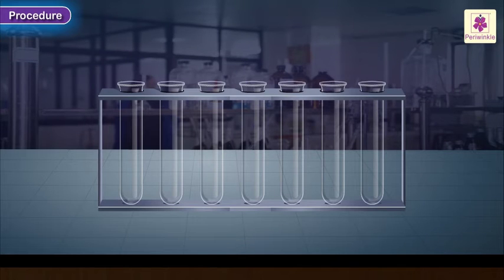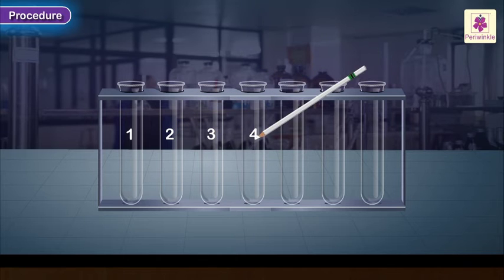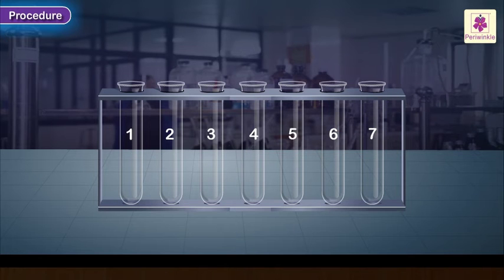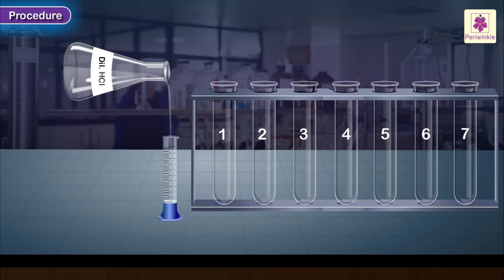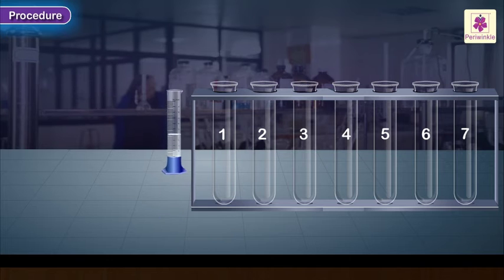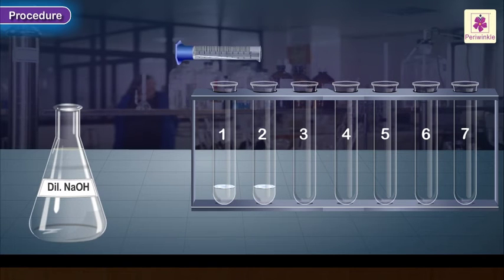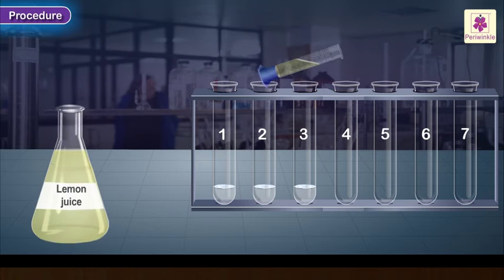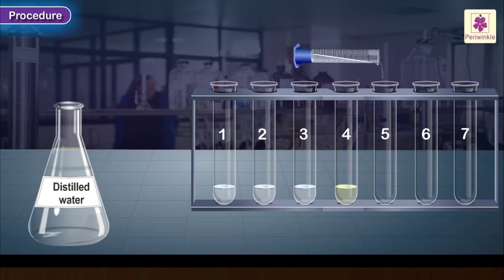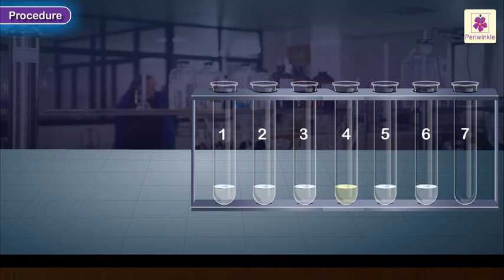Take seven clean test tubes, as there are seven samples to be tested, and using a glass marking pencil, number the test tubes one to seven. Take about two ml of the first test solution, dilute hydrochloric acid. In a similar manner, take two ml of each of the remaining solutions to be tested in the correspondingly numbered test tubes.